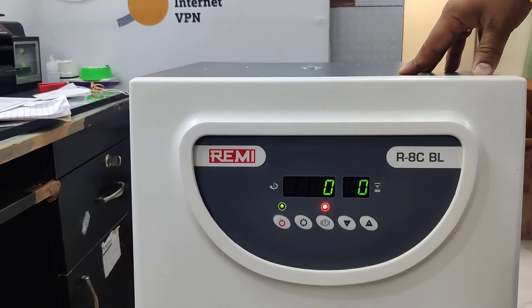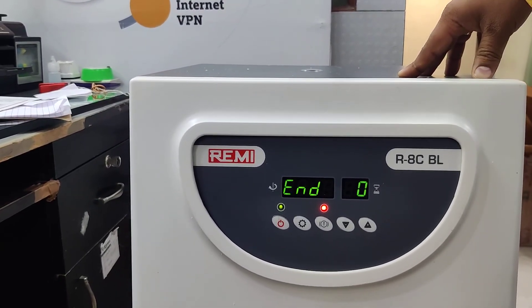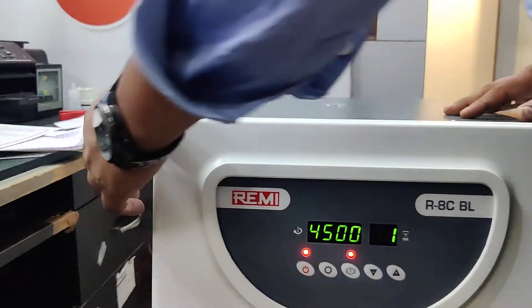Once the RPM comes to zero, an END option will appear — then only we can open the lid. After the END option appears, now we can open the lid.